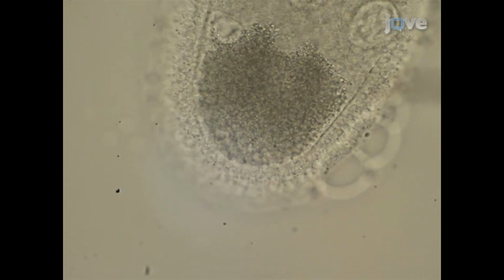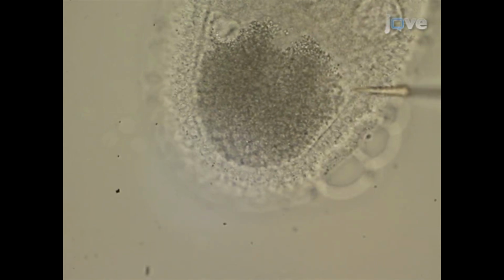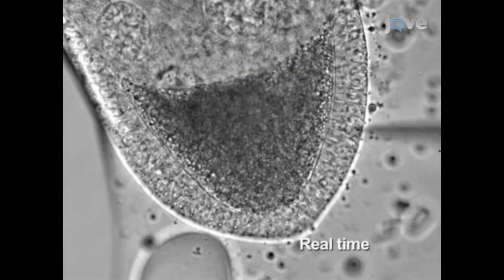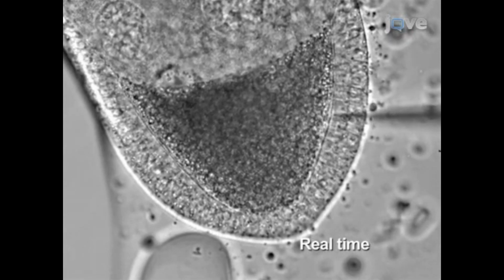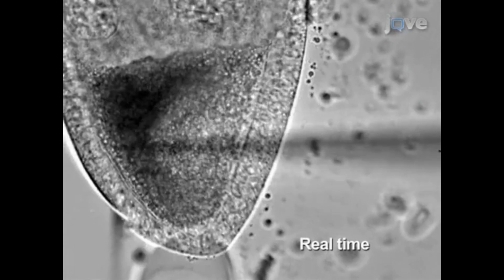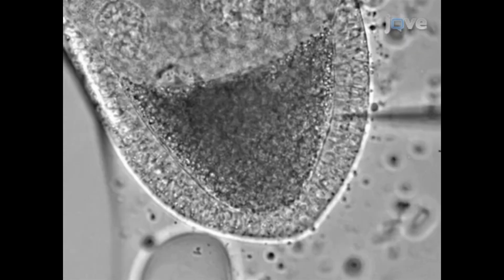Manually lower the needle until it is in the same plane of focus as the oocyte. Using the manipulator controls, move the point of the injection needle until it is inside the oocyte. A fast stabbing motion is often more successful than a slow one.